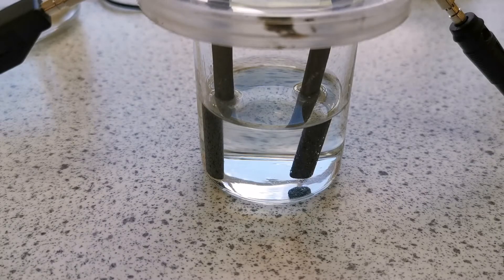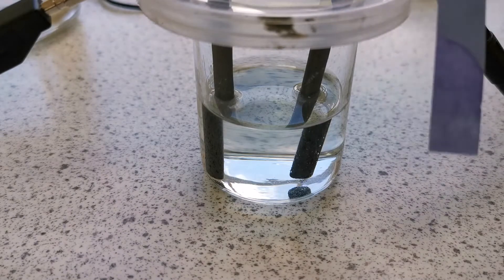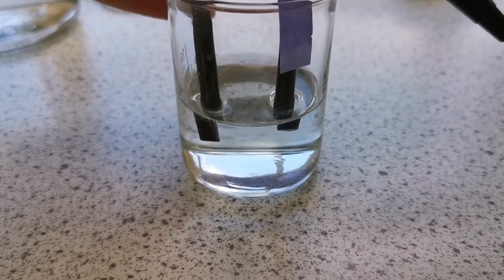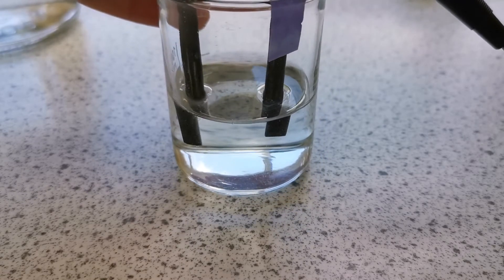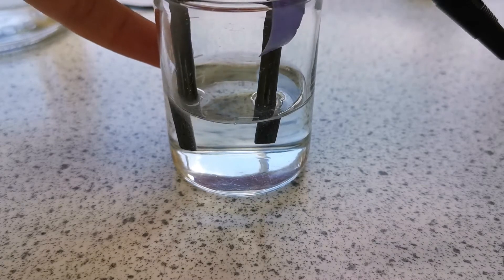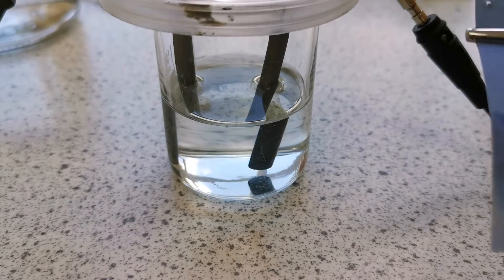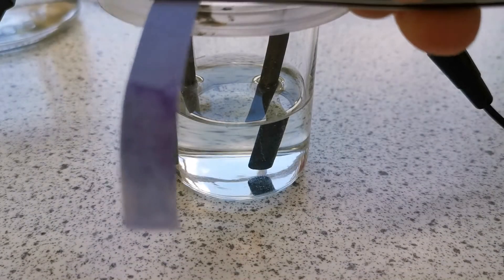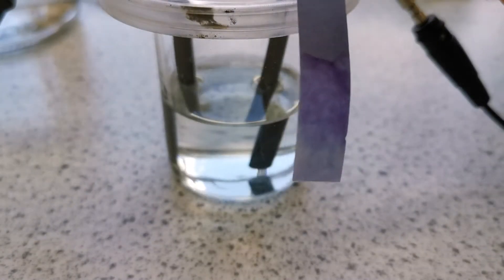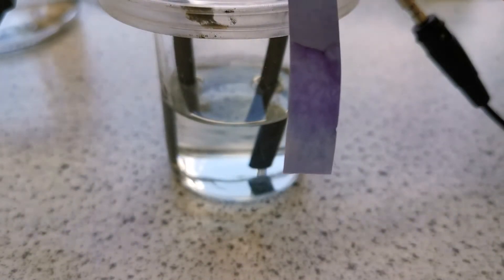Now to confirm that the gas being produced at the anode is chlorine gas, I've got a piece of damp blue litmus paper and I'm going to hold it over the anode. If the gas is chlorine, then the damp blue litmus paper should bleach white. As you can see, the end of the litmus paper has turned white, which indicates the presence of chlorine gas.